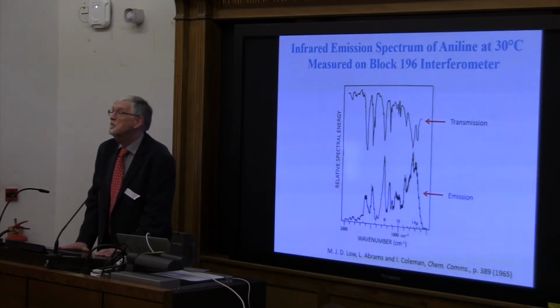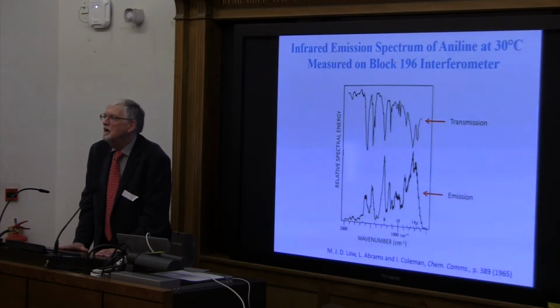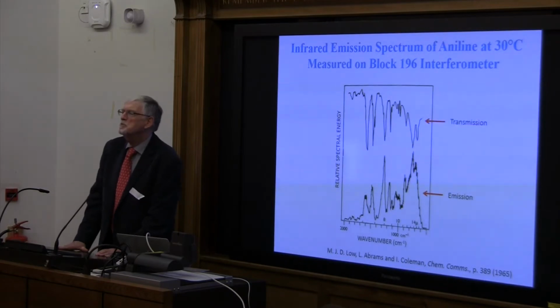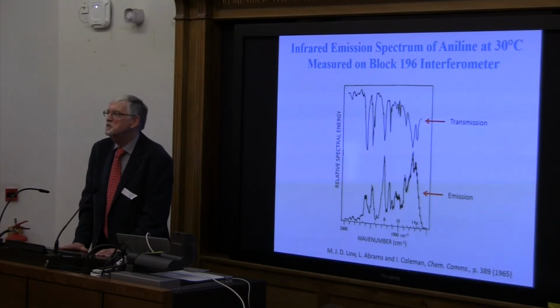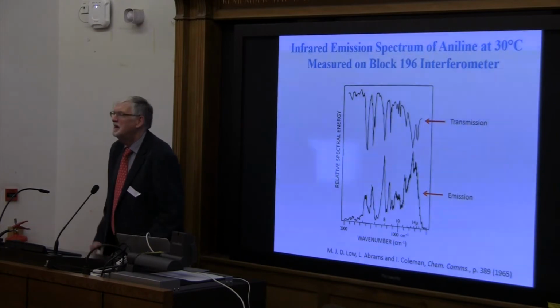One of the things we did was to interface it to a gas chromatograph, and we wrote it up and sent it to the powers that be at Block, and they said you can't publish it. Why can't we publish it? Because we're developing a higher resolution instrument, and your results are too good to show, and you'll show up the results of this new instrument.